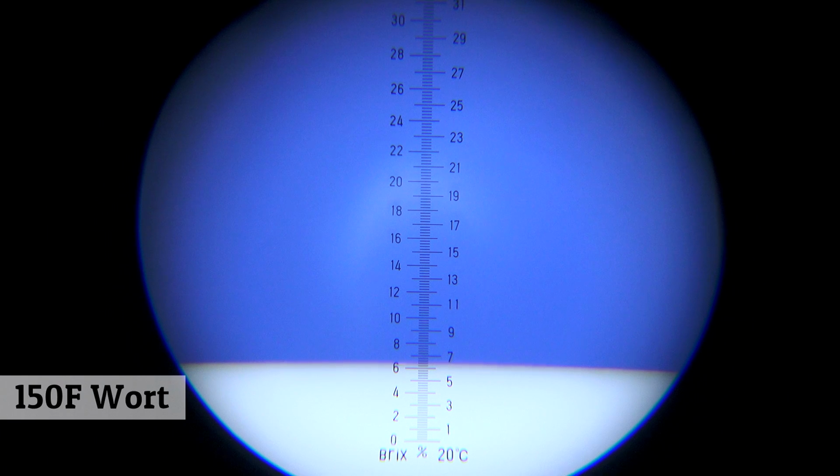Okay, we can see that it reads pretty much almost exactly as the original reading, maybe a decimal point higher, maybe 6.5, 6.6, but still pretty close. And 149, 150 F is a pretty important range for measuring gravity in your mash. I'm happy to see that this is pretty accurate.